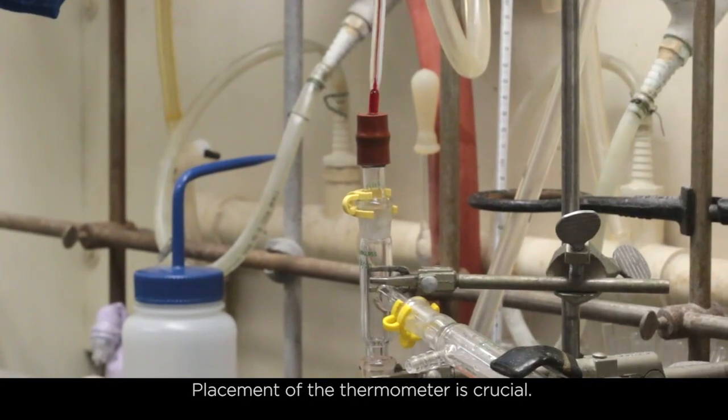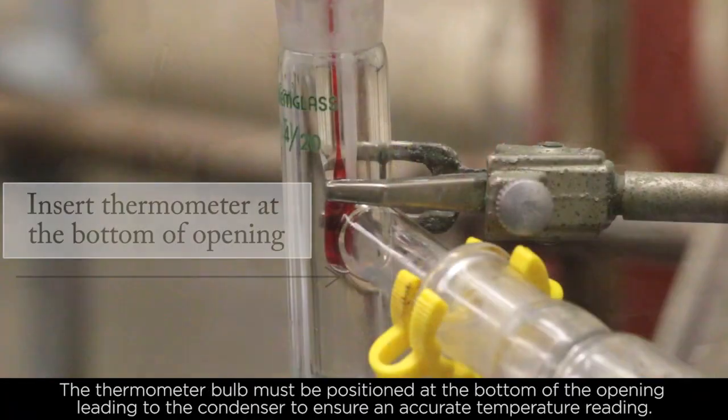Placement of the thermometer is crucial. The thermometer bulb must be positioned at the bottom of the opening leading to the condenser to ensure accurate temperature reading.